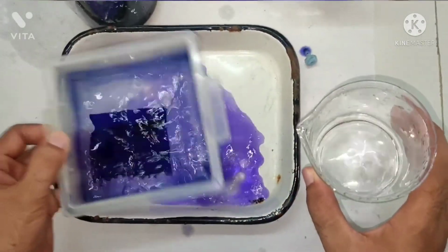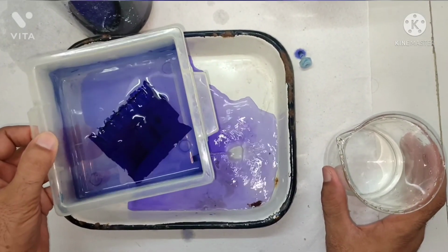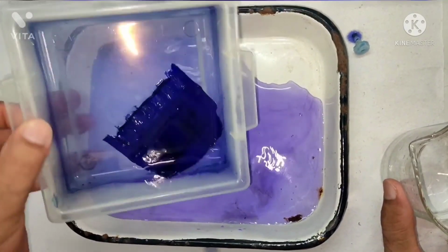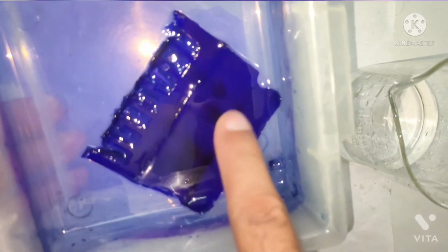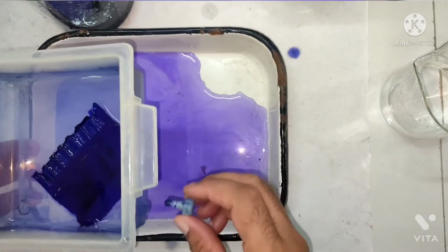So this is just simple water, right? I'm just rinsing the gel with distilled water. If you look carefully, you can see the dark spots on the gel, very light, because the background is blue, right? So you can see the dark background. These are the protein bands actually, right? After destaining, you can see these bands very easily.